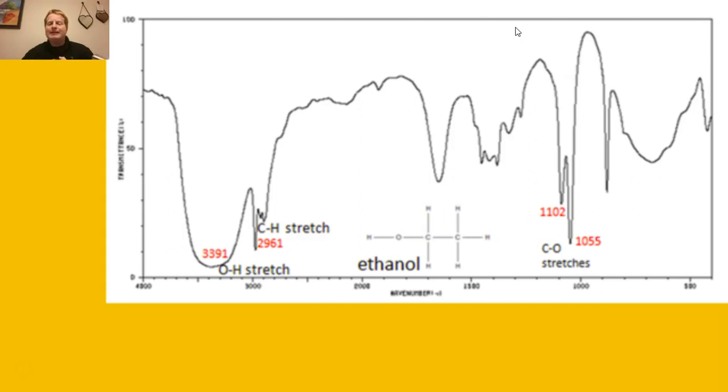And so what we're looking at is, it's important to look at an infrared spectrum from the top to bottom. You're looking at these peaks that are coming down. So you're not looking at it down here and then looking up. You're actually looking at these peaks that start up here and then come down. I always think of it like the stalactites that hang at the very top of the cave. And that's what we're looking at here.